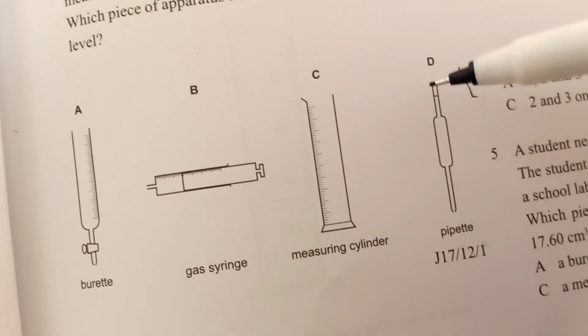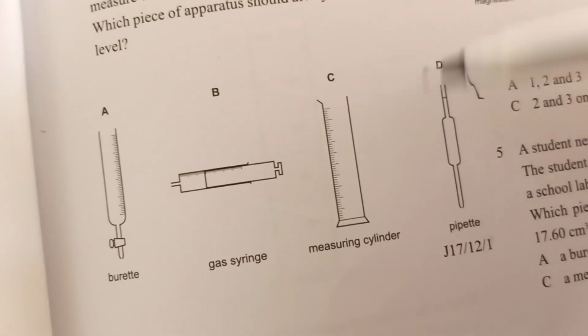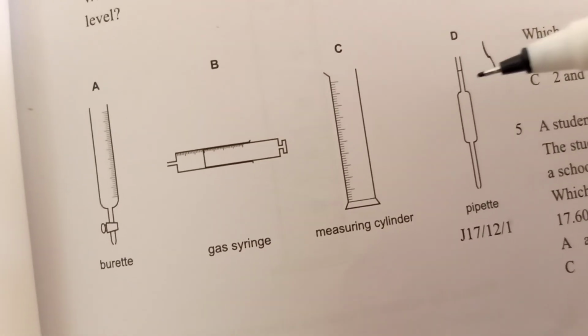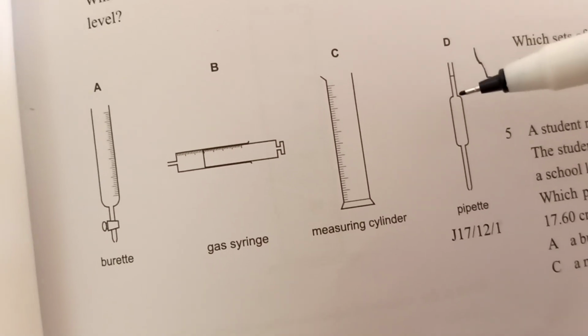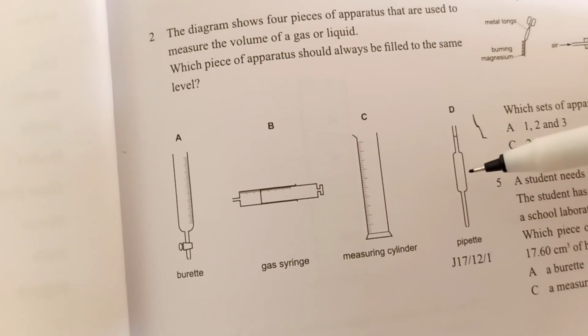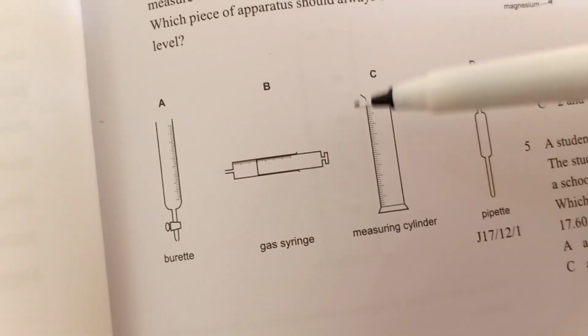Why? Say for example, this pipette is 25 centimeter cube. We cannot use it to measure 20 centimeter cube. We can only use it to measure 25 centimeter cube. So this apparatus will measure only a fixed volume of liquid.